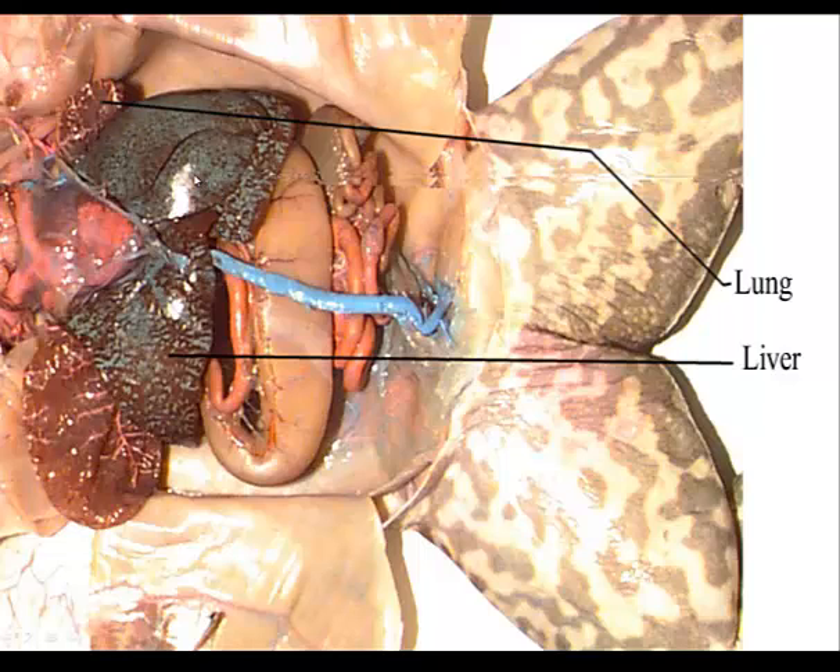Outside of the ovaries, the most prominent organ, just like in the shark, is going to be the liver. The liver is going to have three lobes: the right lobe, the left anterior lobe, and the left posterior lobe.